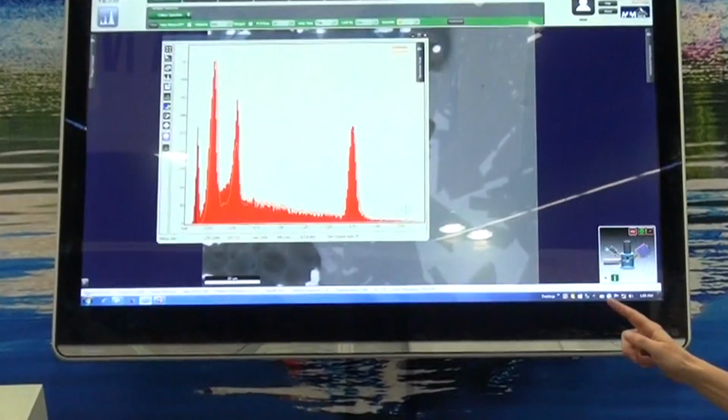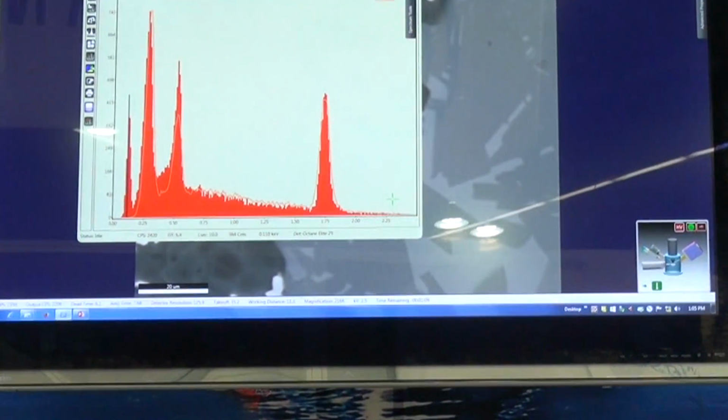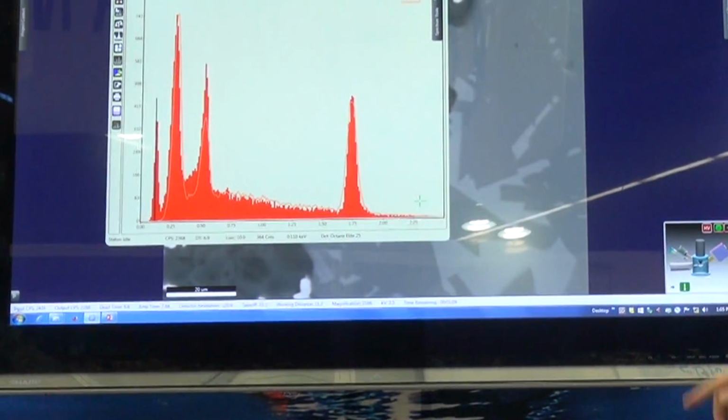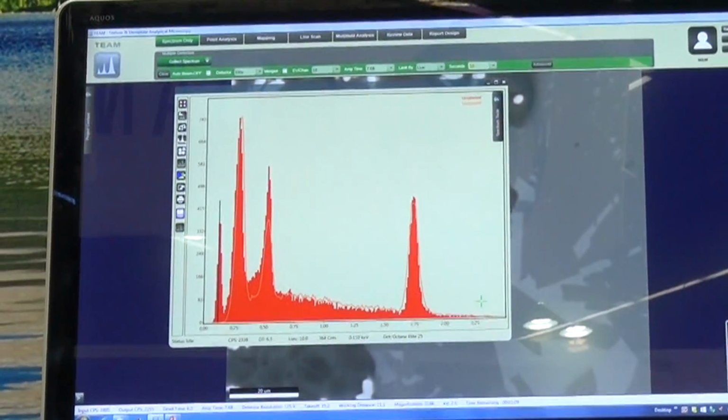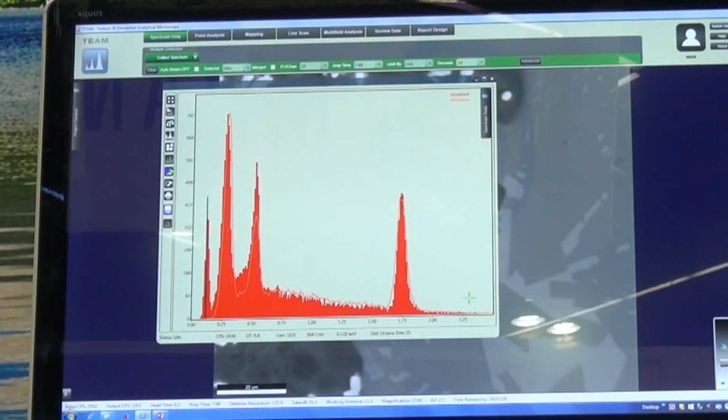The line that's overlaid is the polymer window, and they're rescaled to the silicon peak on your right. And you can see silicon L. We're so far down that in a polymer you get heavy absorption. The nitride window is a lot thinner, so that means more X-rays can go through. So you have a strong L line here with the nitride window that you wouldn't have with a polymer window.